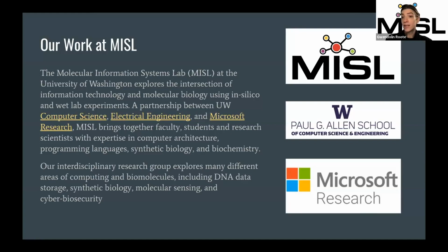So we're in the computer science department. We're the only wet lab in the computer science department, so kind of on our own in some ways, but we are working to make computer science tools out of molecular pieces. The most important thing to that whole endeavor is that we have really important connections between physical samples and the data that are associated with them.